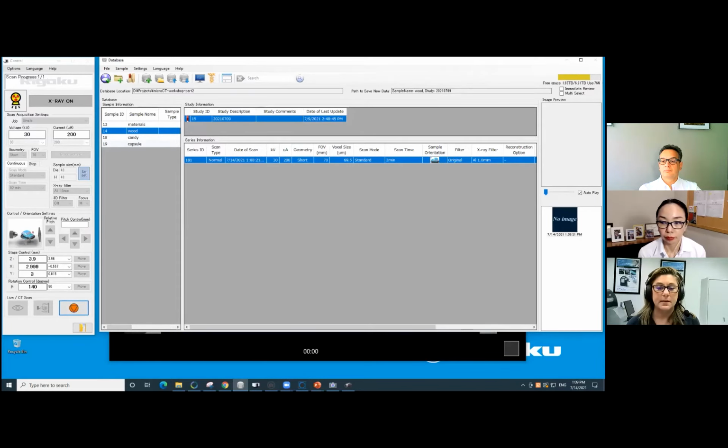And just to let you know, if you want to learn more about X-ray energy choice related to sample, have a look at our third webinar that I think is called Food and Pharmaceutical Applications, presented by Aya Takase. And Tom could put a link to that for you in the chat. And I'll reference that webinar several times today. So just keep that in mind if you're interested in learning more about that. So in this case, carbon, nitrogen, oxygen, light materials, we're going to use lower energies.